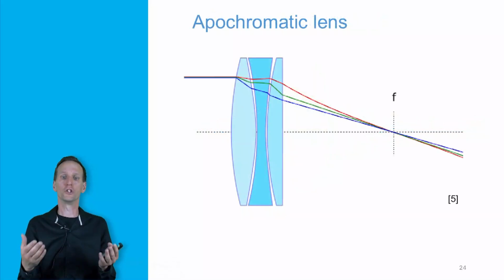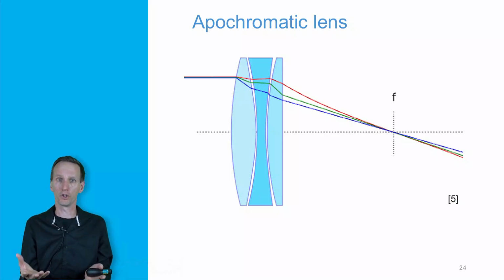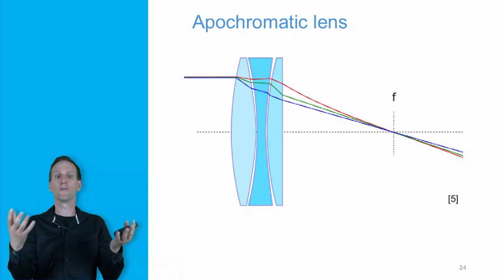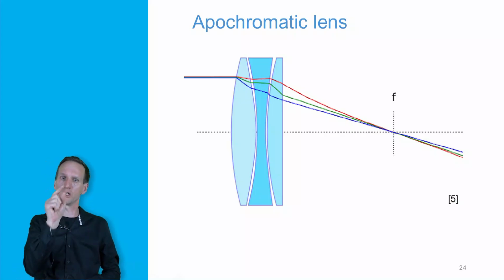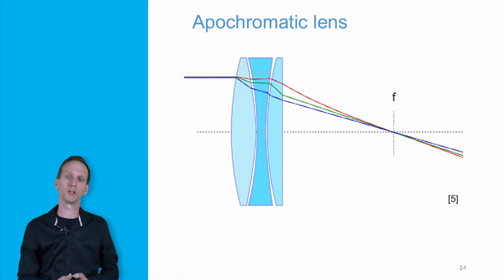Another reason for all these lenses with all different kinds of polishing is to make sure that we have a large field of view over which the illumination is in focus and homogeneous, contrary to what we saw in van Leeuwenhoek's microscope, which was only a single very, very sharply polished lens with very high curvature, which then only gave almost a spot-like image.